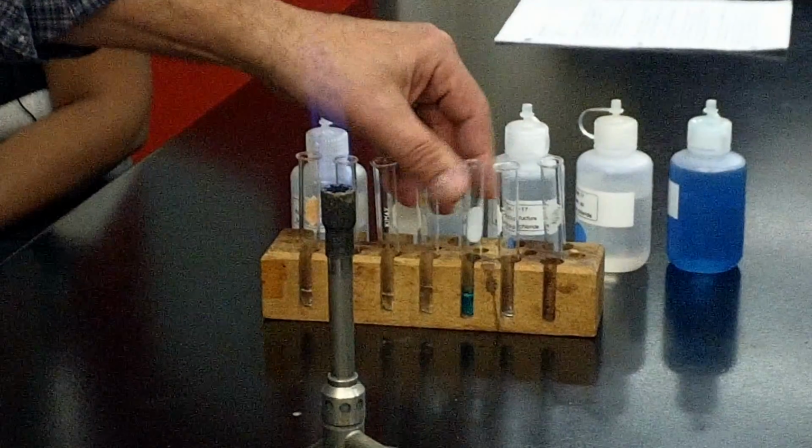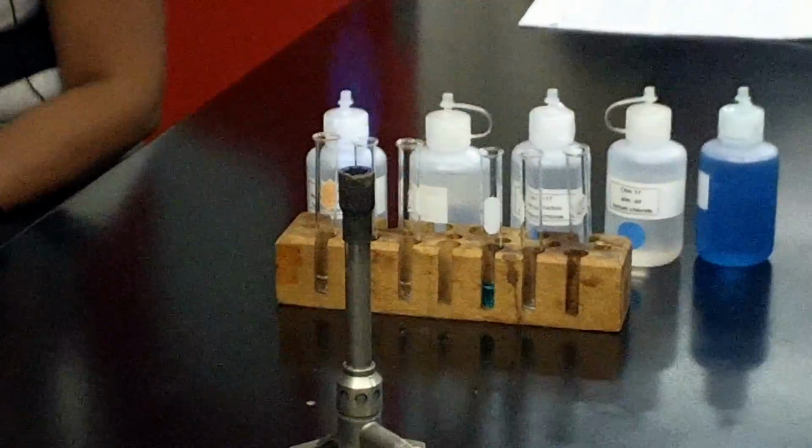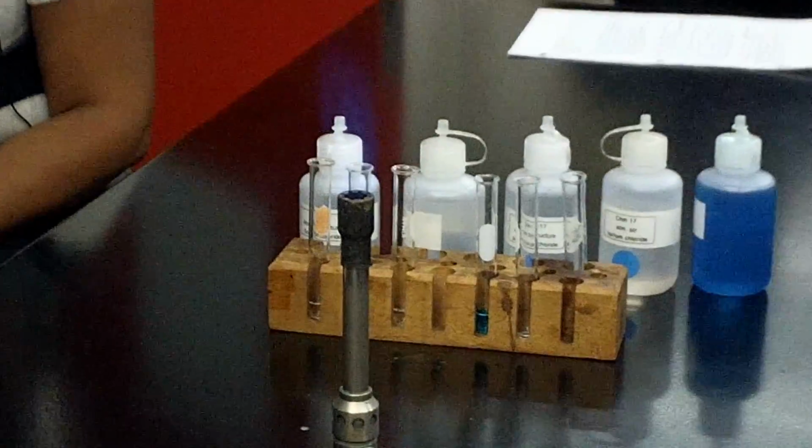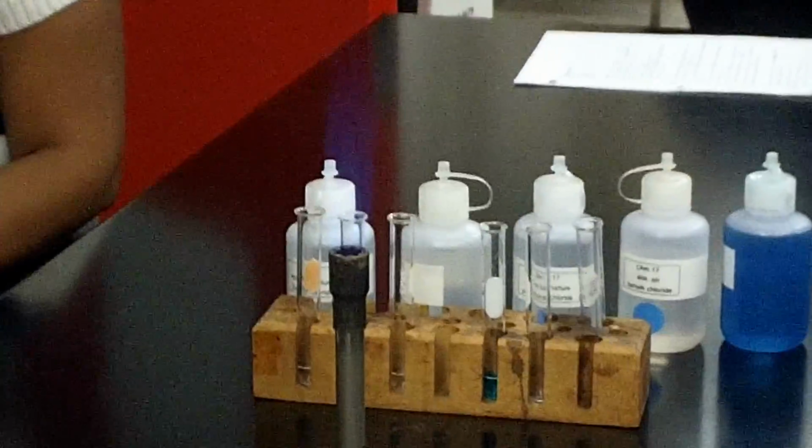So now we're going to pick any one of these. Which one? I like to do barium. Barium's a pretty color. So when I do the same thing, you take the tube and make sure you have a little bubble in here. And make sure you do that. Now you got to watch the first flash of color that comes. You see the color? See the color? So barium gives a kind of yellow color, but it has a little bit of a green tinge to it. Okay? Notice we have contamination on here now. See the white?